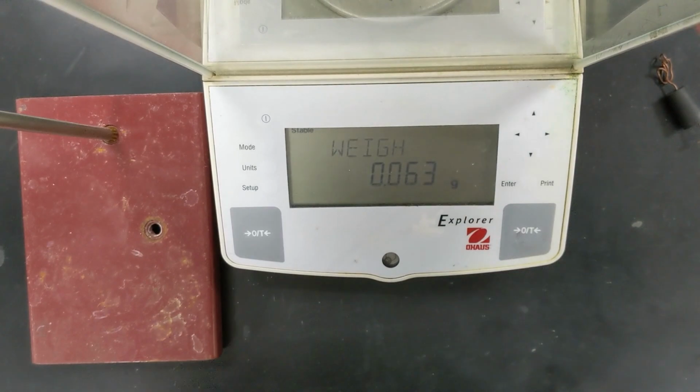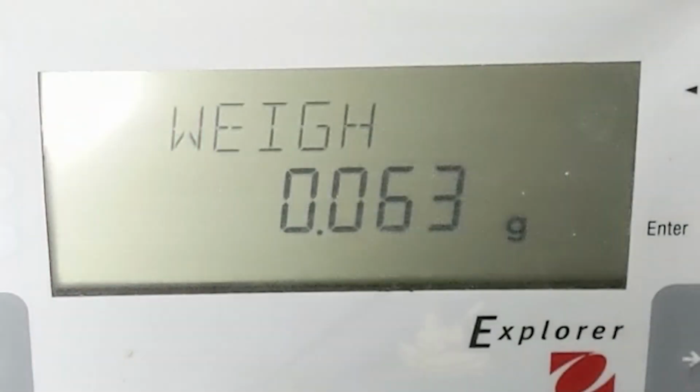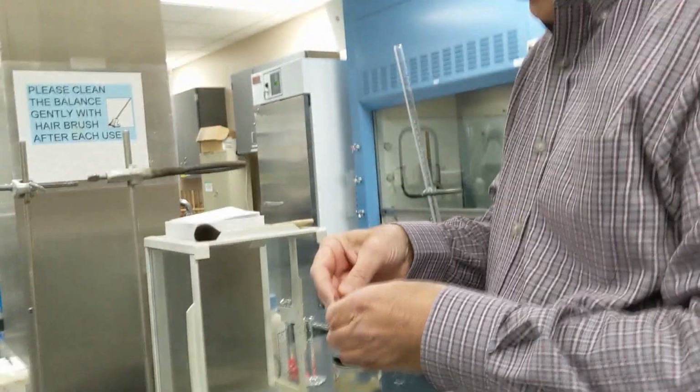And we can see the mass down there. You're going to need to record that in your notebook. And then I'm going to put the magnesium sample on the bottom of this little copper wire. And we're using copper because it won't react with hydrochloric acid.